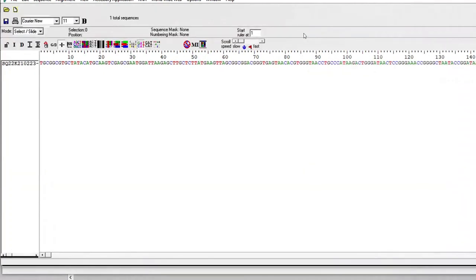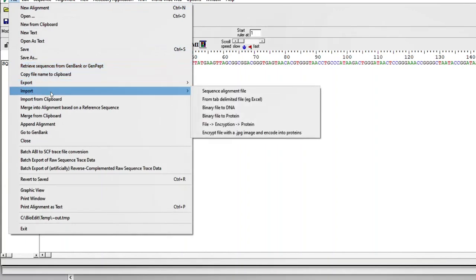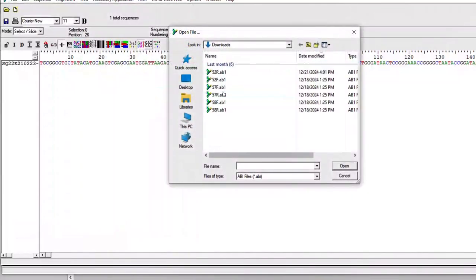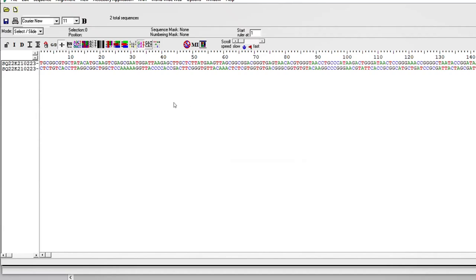So we come back here. Now we are going to upload an alignment file. We come to import, then sequence alignment file. We upload the reverse file and press OK. You can see these are two sequences.